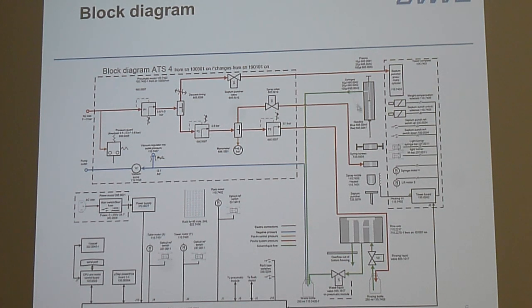Good. Then you see what we have here: the pressure for the septum puncture and the pressure for the spray application. Only for the spray application, because for the contact application we don't need pressure. Then one goes to the rinsing bottle. You see the red one. This is the pressure. Then we have the blue one. This is the vacuum pump.